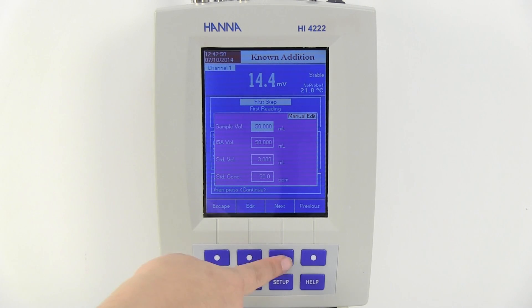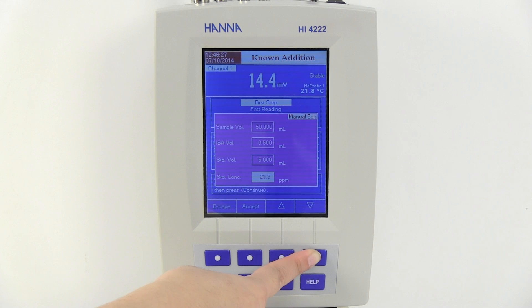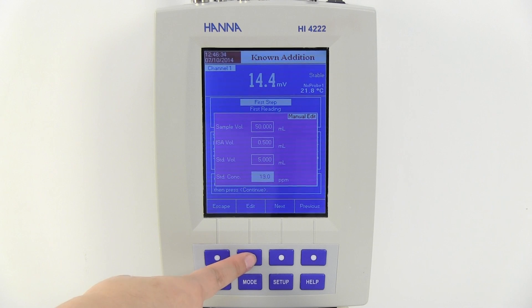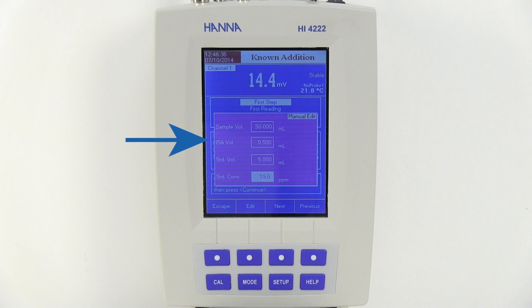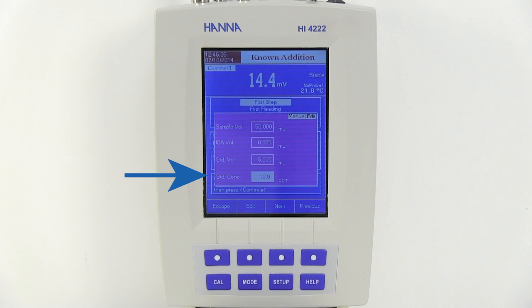Now press Edit and set the method parameters. Use Next and Previous to move between each parameter. We can change values by selecting the parameter and using the arrow buttons. For this measurement, sample volume will be set to 50 mils, ISA volume to 0.5 mils, which refers to the TSAB solution, the standard volume to 5 mils, and the standard concentration to 19 ppm.